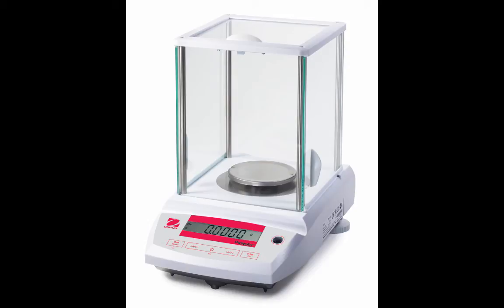Depending on the number of trials you choose to do, you can still get a discrepancy with your average shifting too high or too low. What this leads us to believe then is that the more trials we can perform using any piece of measuring equipment, the better result we're going to be. It's going to eliminate those random errors. And mathematically, we can eliminate them by using an average value.